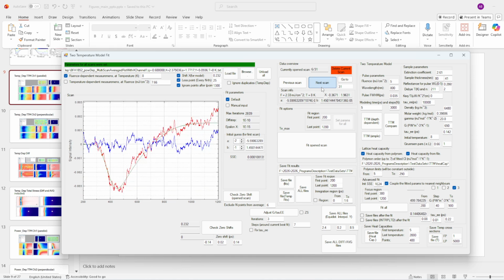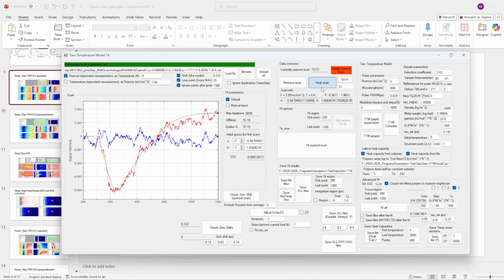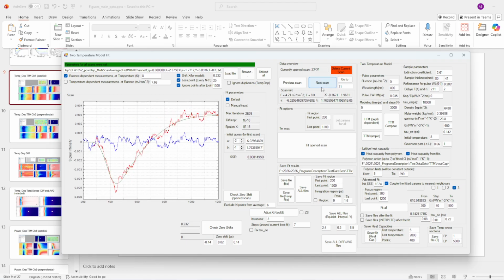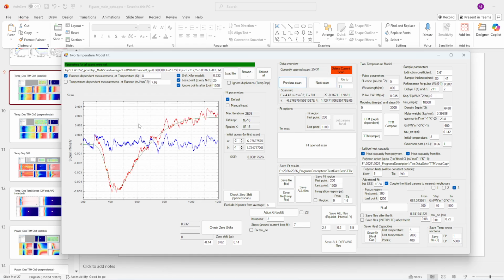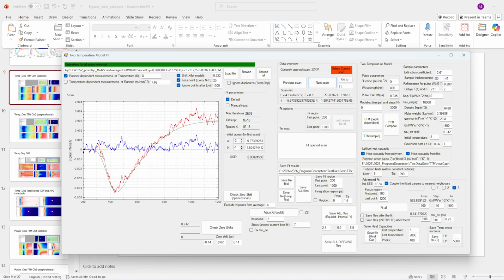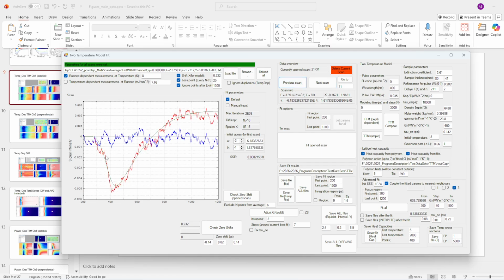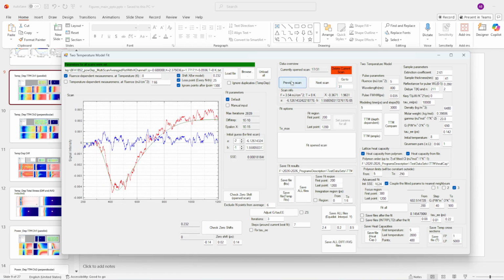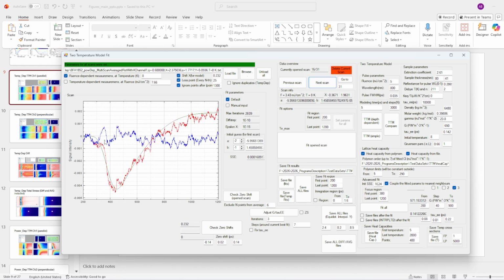Again, sometimes if you do, for example, the zero estimation based on one scan, and then you see some clear pattern. For example, here I see the pattern that the scan starts early, the fit starts early. Here again, fit starts a little bit early, but there is no crossing. Here it's kind of the same. Here it's not the same. Here fit starts early. Maybe I need to check the zero. Here also fit starts early.